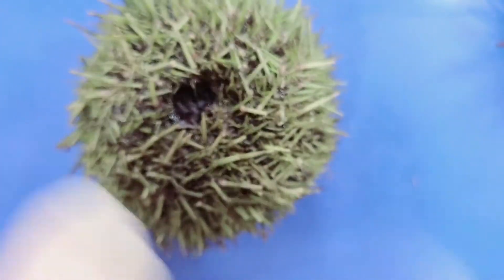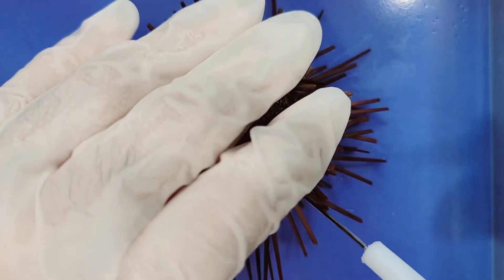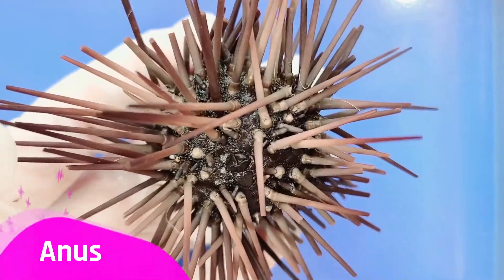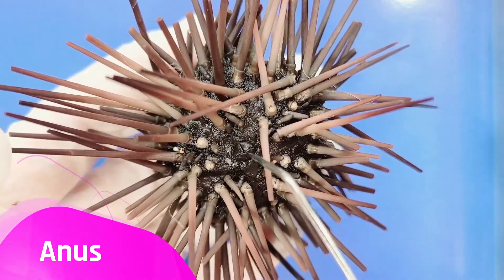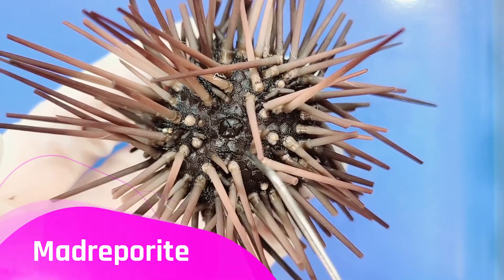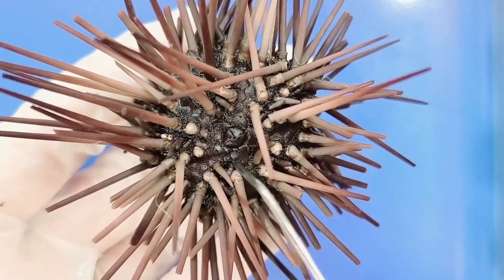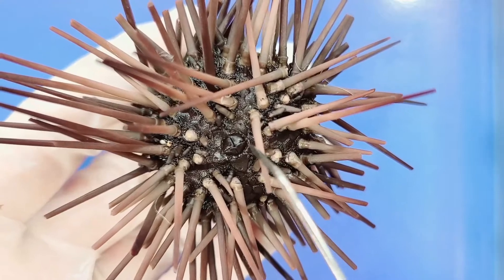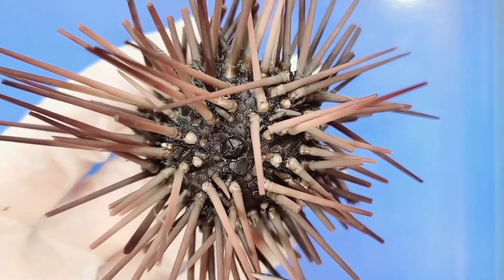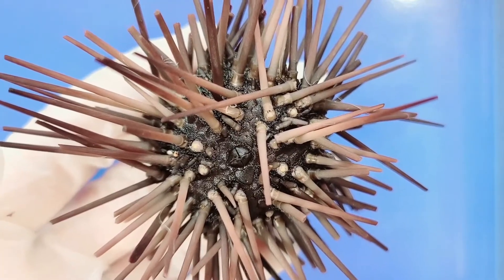On the purple sea urchin's aboral side, you can see the anus and next to it the madreporite. You can also see a flower-shaped structure around the anus called the genital plates. Each plate has a single duct where gametes are released into the water.